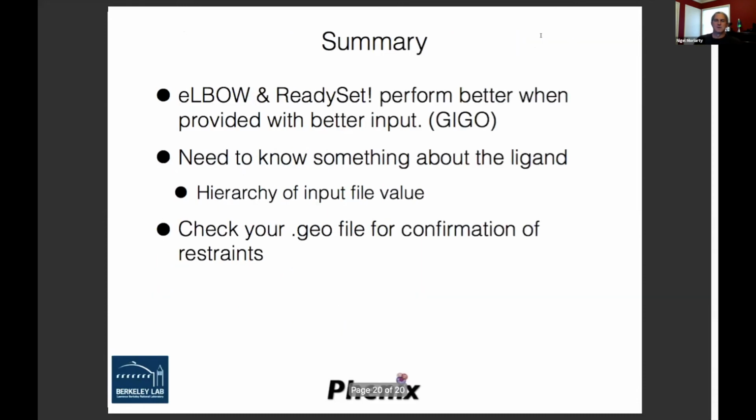Now, I hope that I have given you the main points of restraints. Elbow and ReadySet will perform better if you have better input. And that is true of just about every program: garbage in, garbage out. And you need to know something about your ligand and your model.